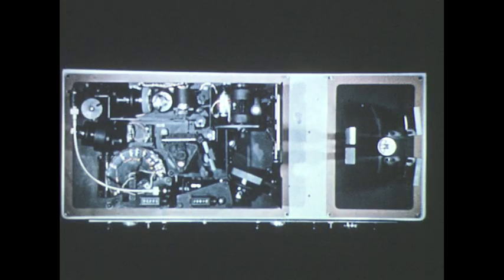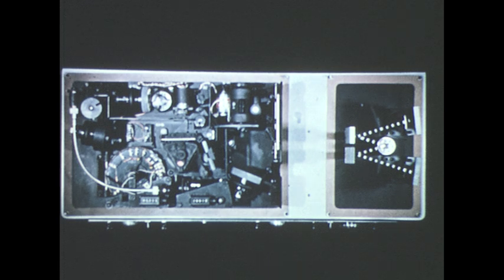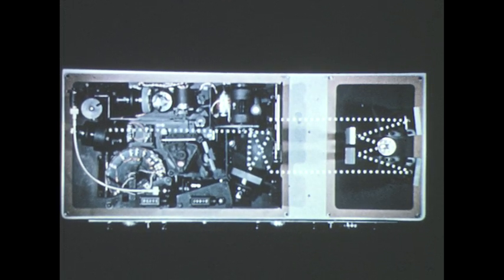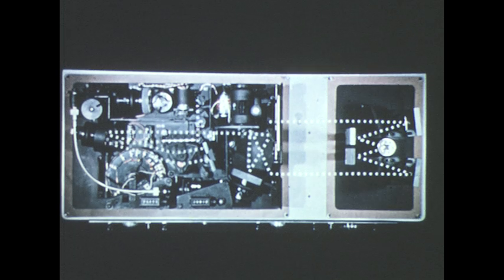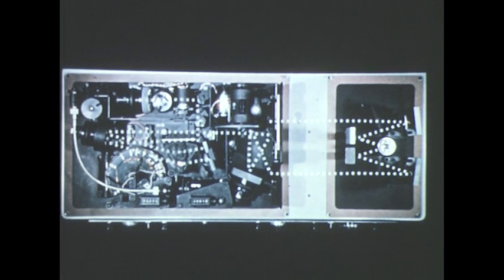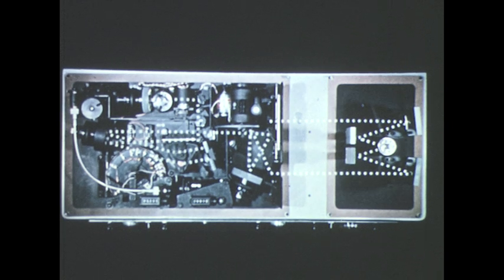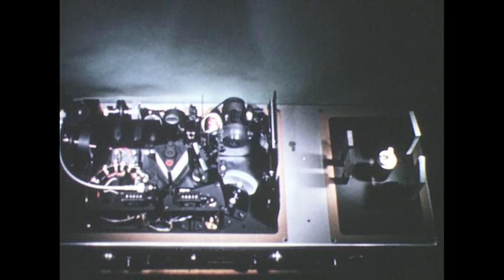In actual practice, the optical path of a double beam instrument is more complex than has been indicated by the animated diagrams. With this instrument, atmospheric water vapor and carbon dioxide bands are completely eliminated from the absorption spectrum obtained.